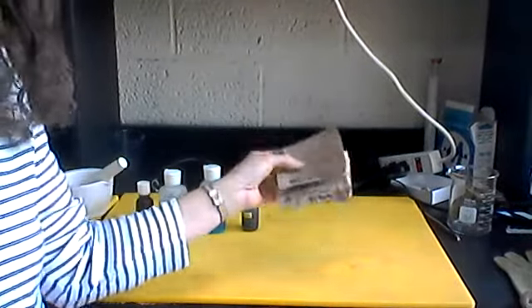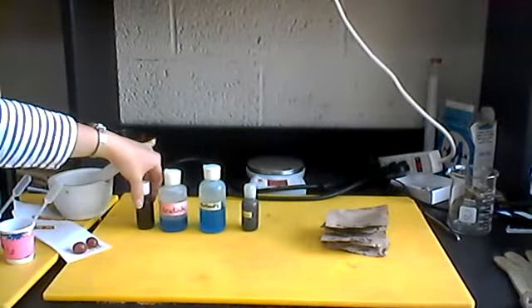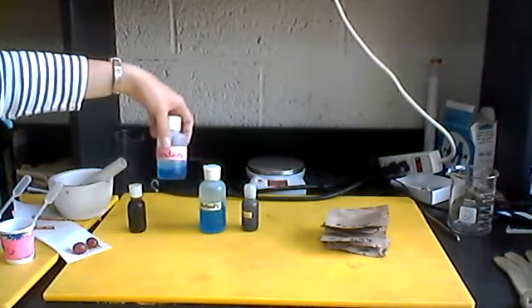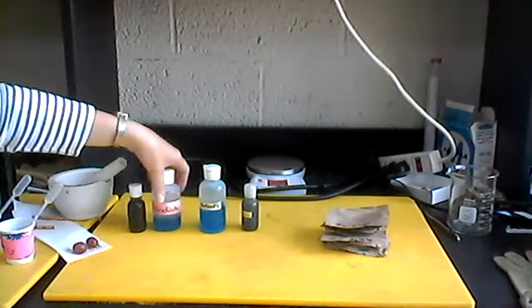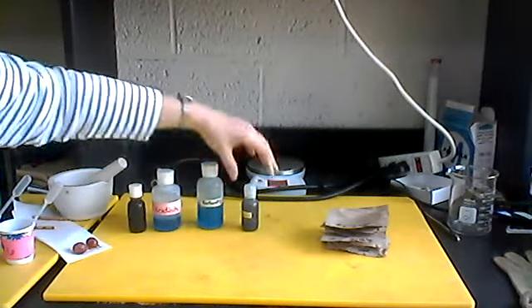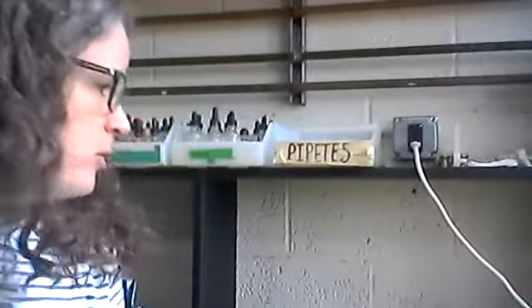So first we're going to look for the presence of lipids by using just a paper test. It's a really basic test. We've also got Lugol's iodine to test for starches, Benedict's reagent to look for reducing sugars, Barfoed's reagent to look for monosaccharides, and then Biuret's reagent, which tests for the presence of proteins. So I'm going to run through each of those tests using these foods. I'm going to put some gloves on, get the hair out of the way, and then I'll get rolling.